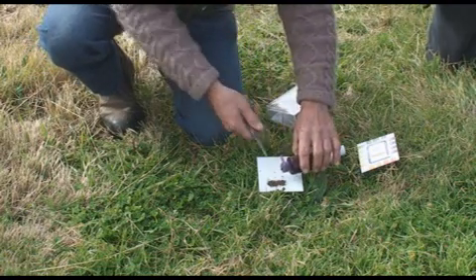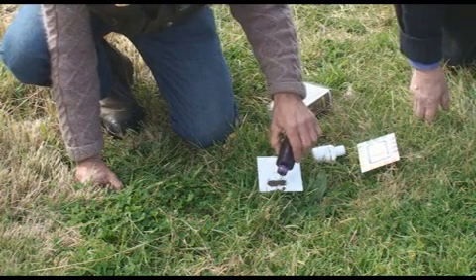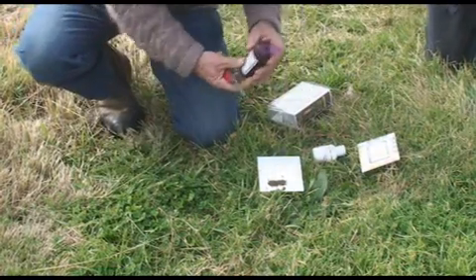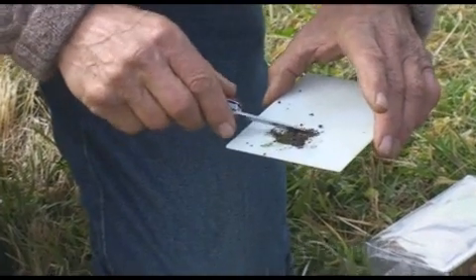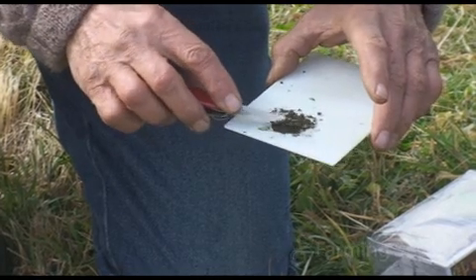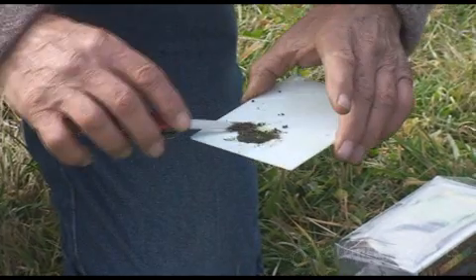Add a few drops of this buffer to the soil on the plate. The idea is to make a paste — you might need five or six drops, and you just want to mix it up until it forms a paste. If you put too much buffer on, just add a bit more soil. Mix it up.